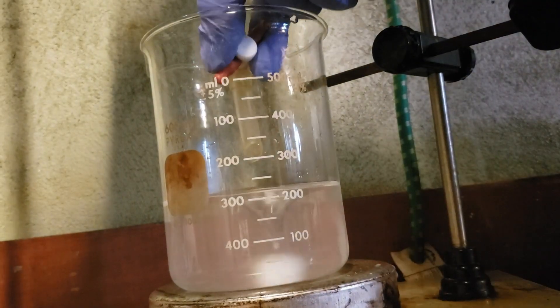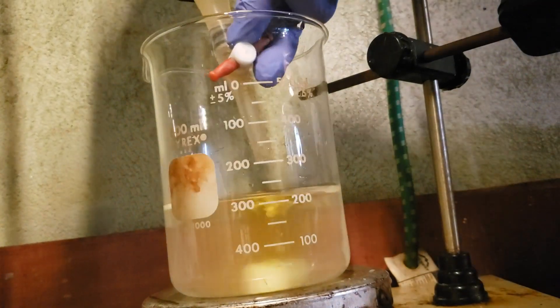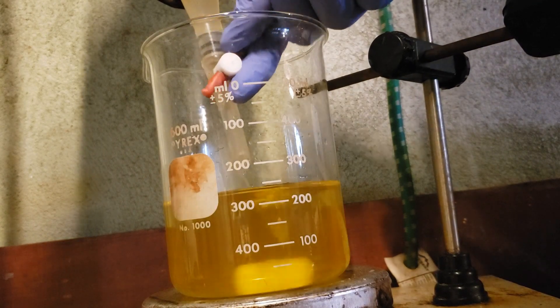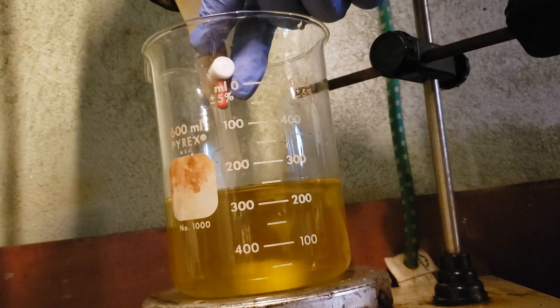Into this, the ascorbic acid solution is titrated. This causes a color change from clear to yellow to teal and finally to the dark blue color of molybdenum blue.